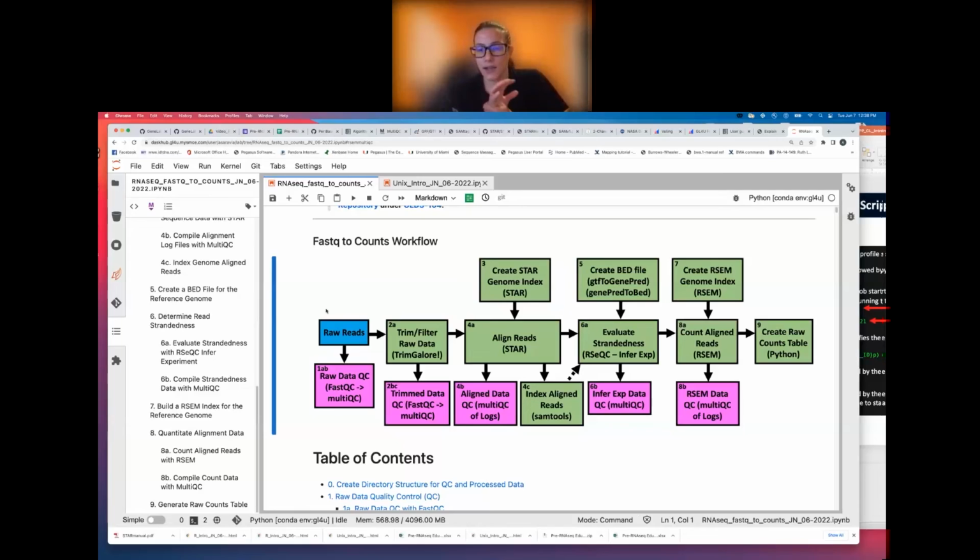So Anaconda, or the shorter version being Conda, is what a lot of bioinformaticists use to install tools in their own isolated locations. Because these tools use a variety of different languages and different versions of those languages, we can have incompatibilities if we try to install all of the tools in one place, because some of them might use the same languages as others, but different versions. And so we create little environments through Conda to be able to install our tools.